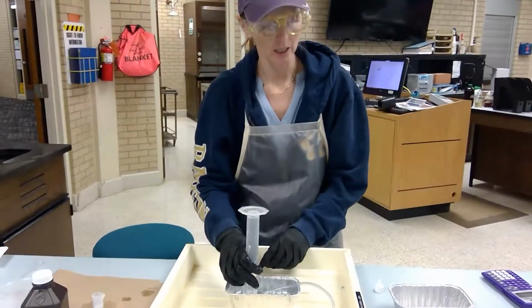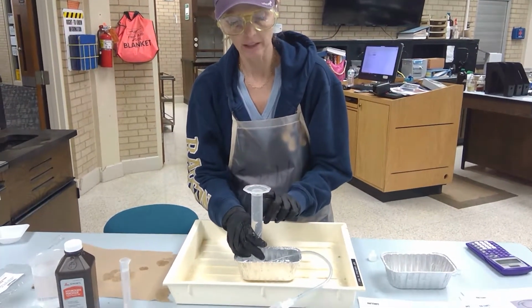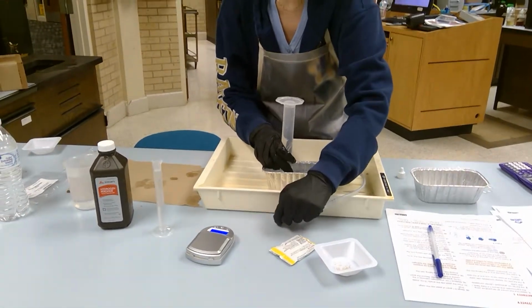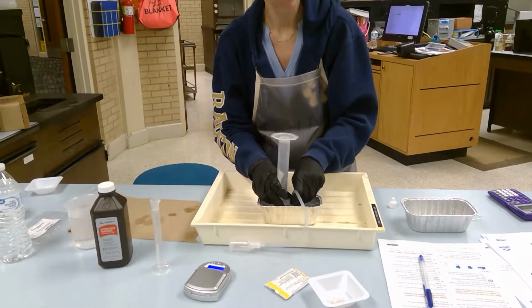Okay? If you have no gas available, you would actually record 0. Okay? So then you're going to turn on the balance, tare it out.